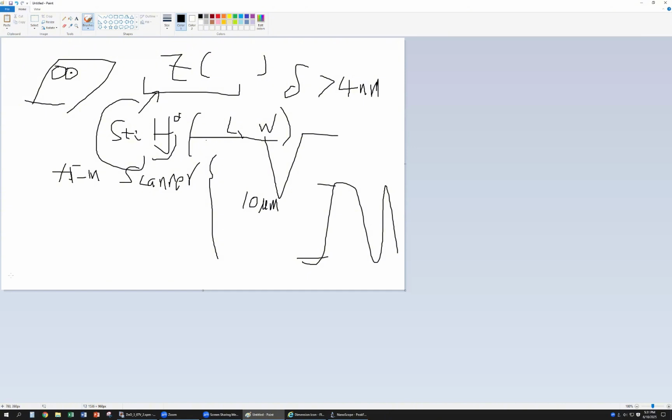Adhesion force is different. It is only related to the contact point. A larger area means larger adhesion and a smaller area means smaller adhesion, like adhesive tape. Adhesion force is different, and we do not calibrate any kind of probe parameter for it. You just get it from the measurement.